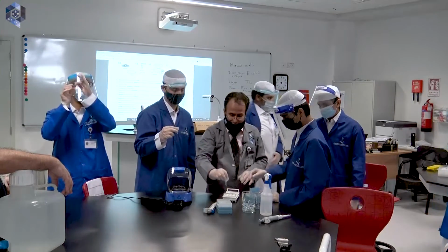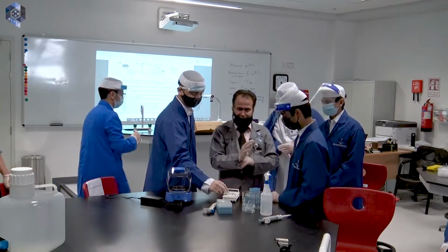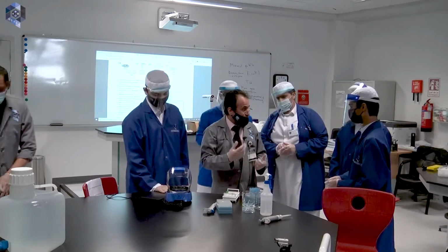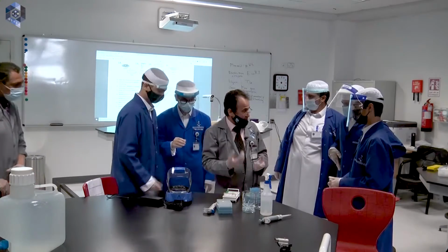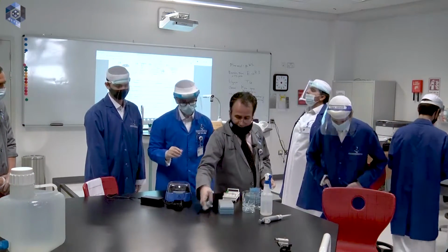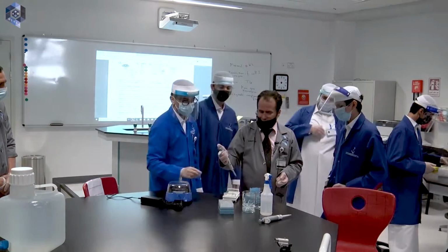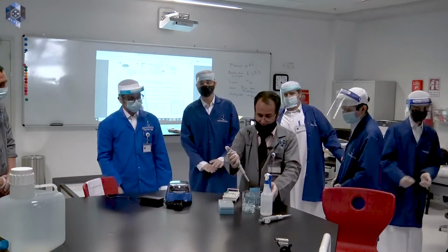The lower one. That's why we need to get rid of the upper layer. The upper layer, the liquid part, is called supernatant. The one that goes down is the pellet. Okay. So we will get rid of about 150 microliters of the supernatant, the liquid part, and discard them here.